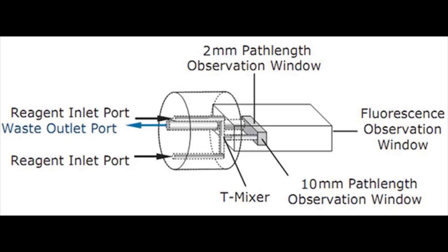The SX20 allows the use of both a 2mm and a 10mm path length. The path length is selected according to the position of the light guide and the absorbance detector on the cell block. Consult the manual for details.